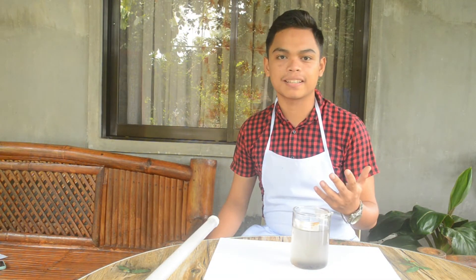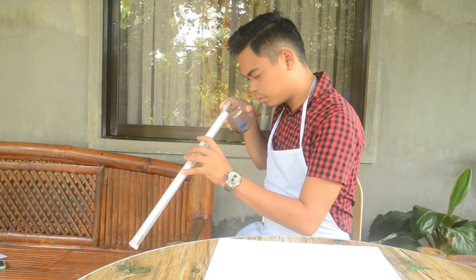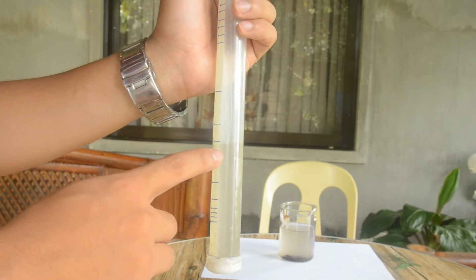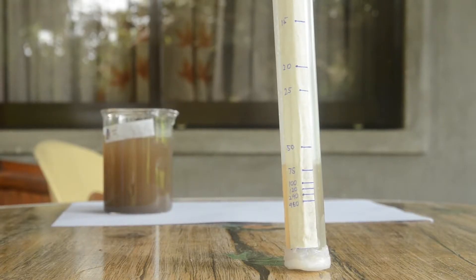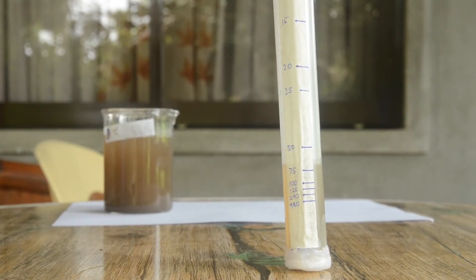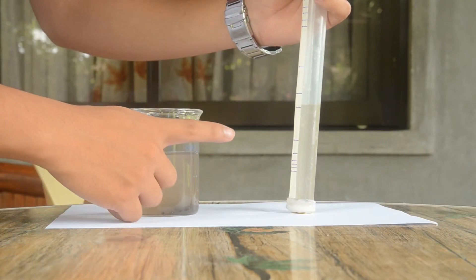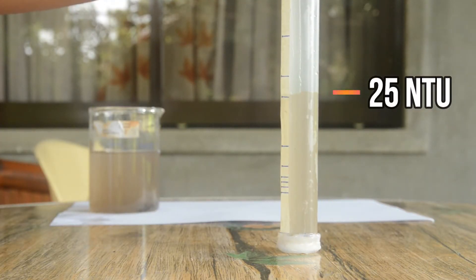So how do we use it? The way we measure the turbidity is through pouring the water slowly into the tube until the block mark located at the base section becomes invisible to our naked eye. And then, we look at the water level and its corresponding measurement. We must be in a room where there is enough source of light, but not direct sunlight. If the water is very turbid or muddy, the water inside the tube is less, and the reading is a high number of NTU. On the other hand, if the water is less turbid or it is clearer, the water inside the tube is much, and the reading is a less number of NTU.